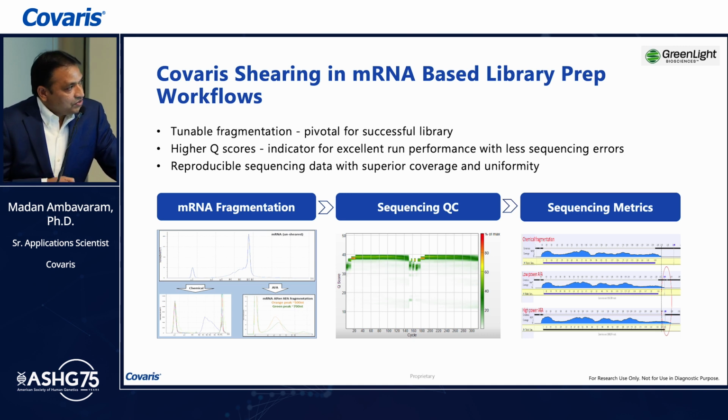And also, when speaking about the sequencing metrics, they found the context where it is a critical region and better sequencing regions. Using that, they used various settings and found the right fragmentation, which helped to identify better sequencing and better coverage in the critical regions.